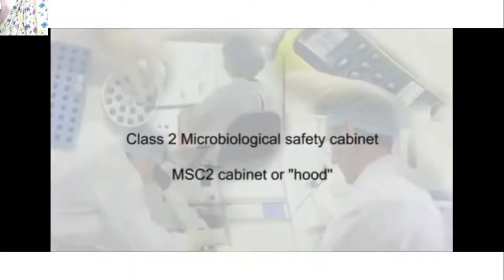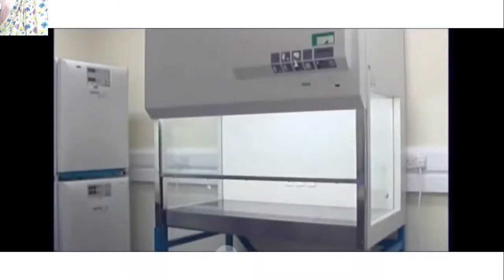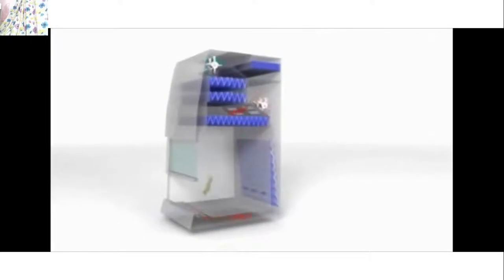Microbiological safety cabinets — also referred to as MSC2 cabinets or hoods — are probably the most important piece of equipment for cell culture. When operated correctly, they provide a clean working environment whilst protecting the operator. Operator and product protection is provided through a combination of airflow, negative pressure, and HEPA filters. Cabinet exhaust may be ducted to atmosphere or recirculated through a second HEPA filter back into the laboratory.